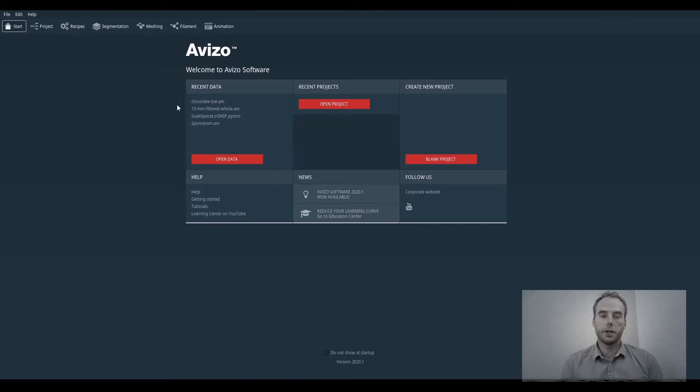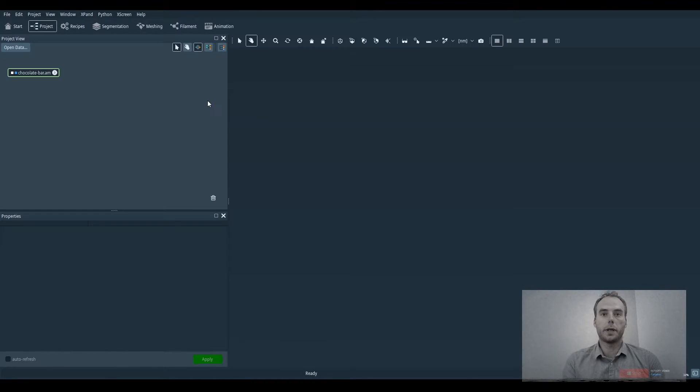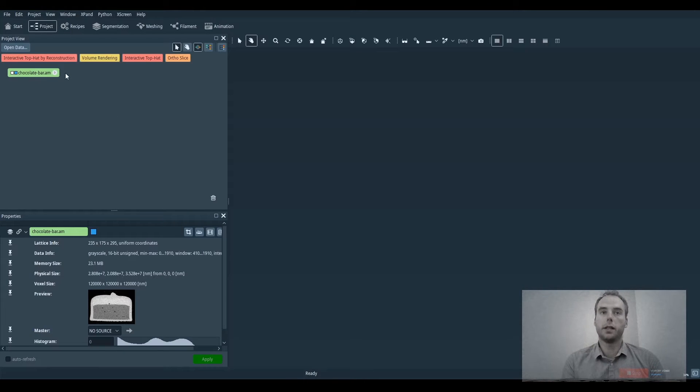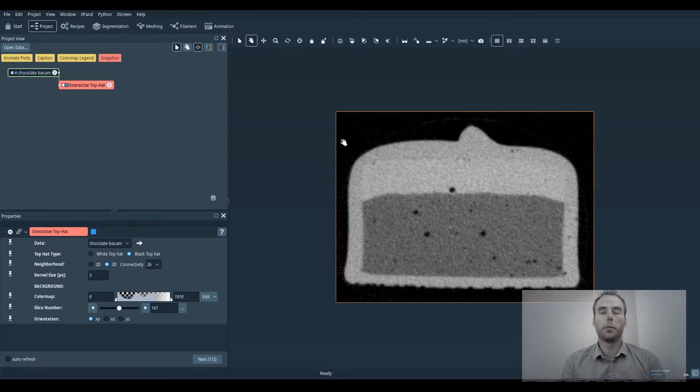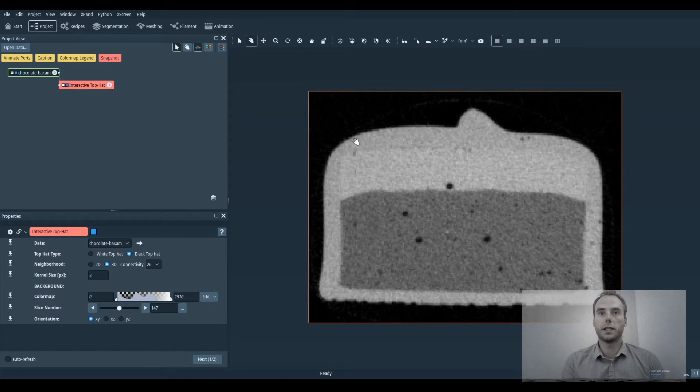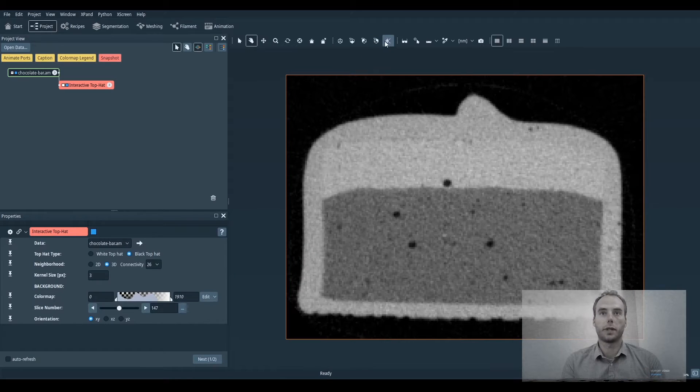I'm going to show you how to use the interactive top hat by reconstruction module and the interest of this module compared to the classic interactive top hat.